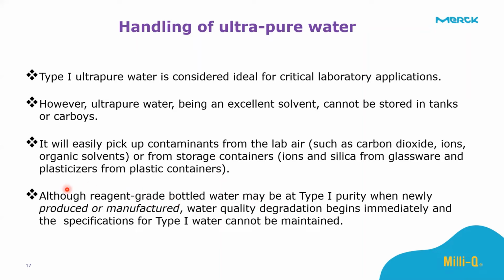One very important point is that although reagent bottled water may be type 1 purity when newly produced or manufactured, water quality degradation begins immediately, and the specifications of type 1 water cannot be maintained. So it means once you have that bottled water, the moment you open it, the water degradation starts.